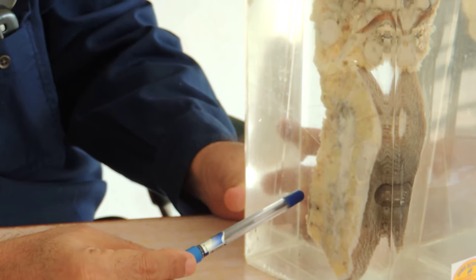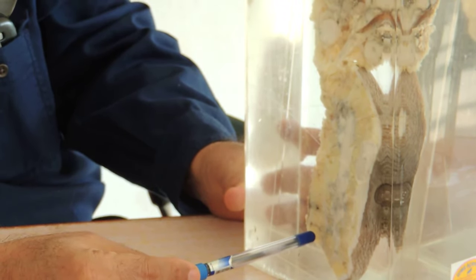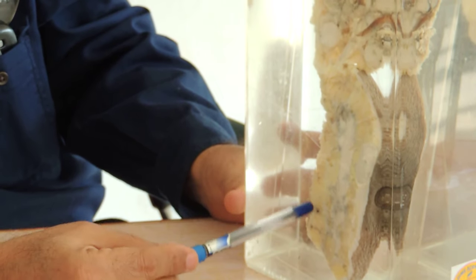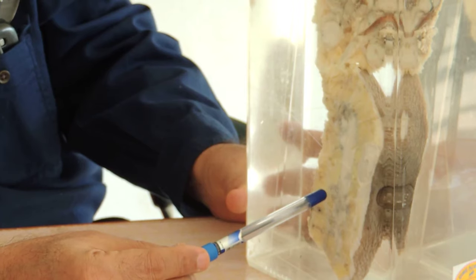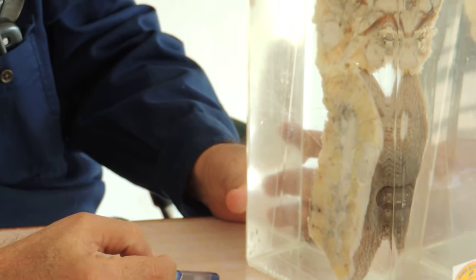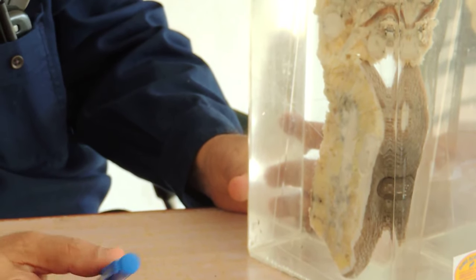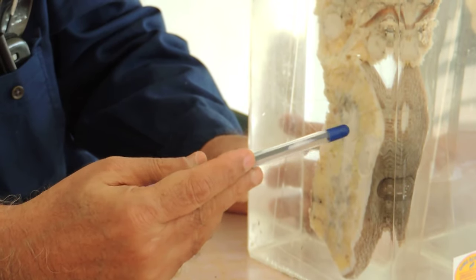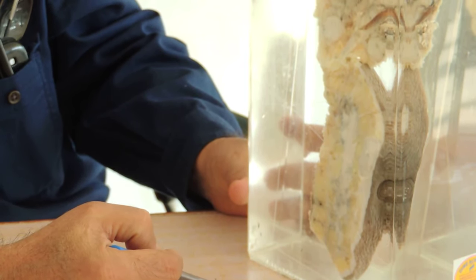The cut surface shows an elongated lesion which is about 5 to 6 centimeters in length, and its borders are irregular and infiltrating into the surrounding normal appearing parenchyma of the breast. In addition, there is another tumor which is about 3 centimeters in diameter, grayish white in color.